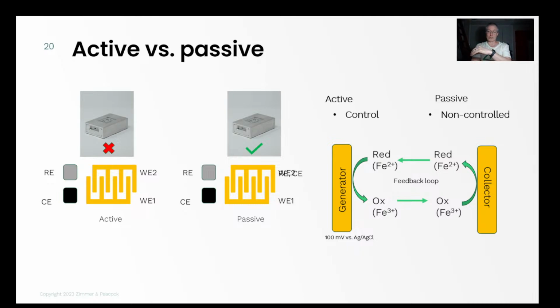It would diffuse across, you would be collecting it, or regenerating rather, the ferrocyanide, and it would probably diffuse back across. So the nuance of me saying whether the Anapot EIS can be made to work in a generator collector mode does depend a little bit on the electrodes, and it also depends on the solution that you're using. But if it was a simple system like 2 gold electrodes and a ferrocyanide solution, then it probably would be running in a generator collector mode.